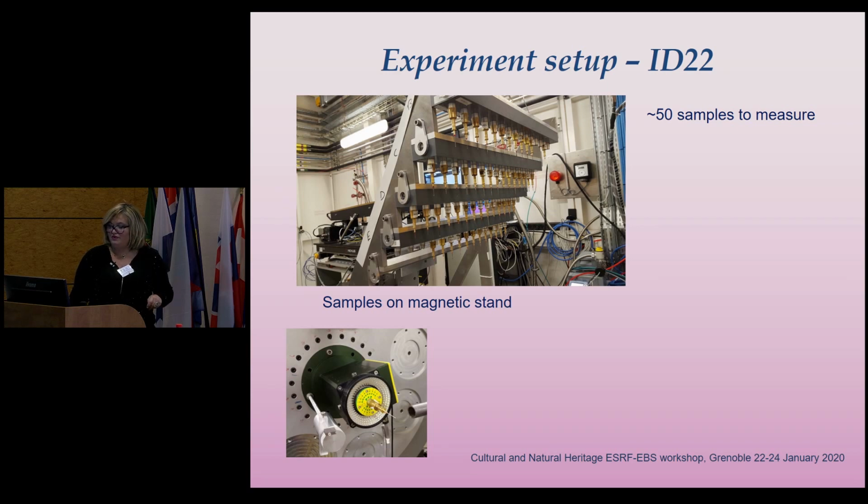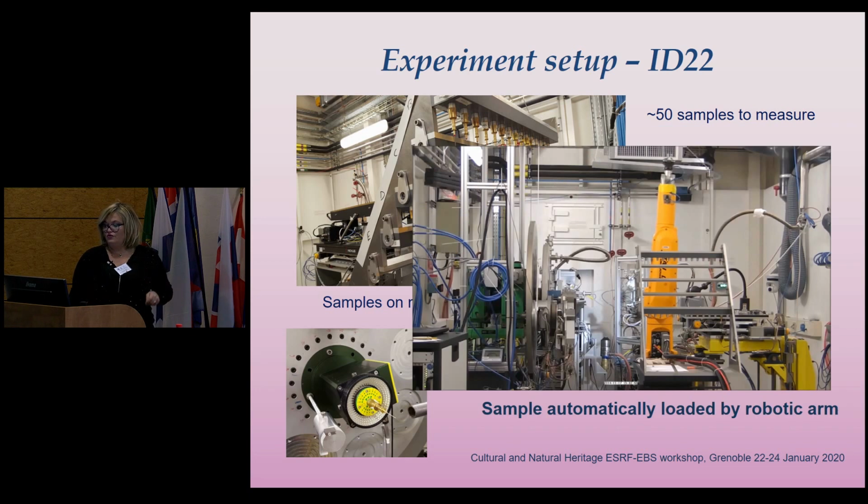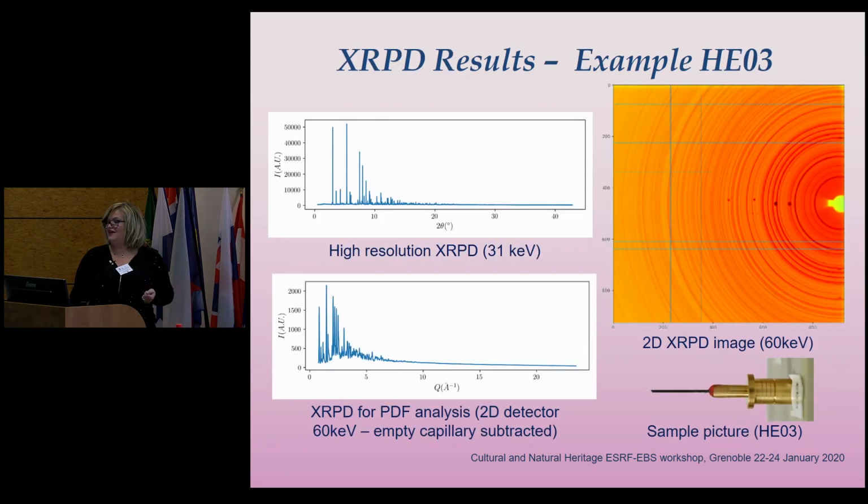fill all the capillary. The sample was put on a magnetic stand, and thanks to a robotic arm it's possible to study all these samples at ID22. And at ID22, with the help of Catherine, we could do analysis all day and all night, during the morning and during the night also. Thank you again.